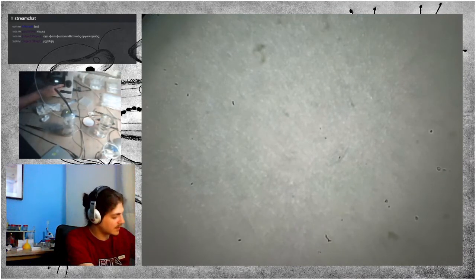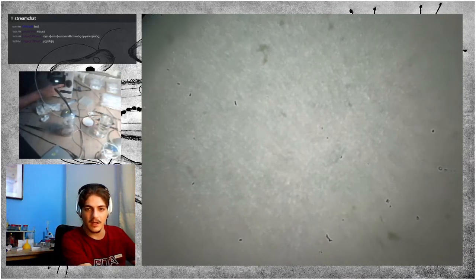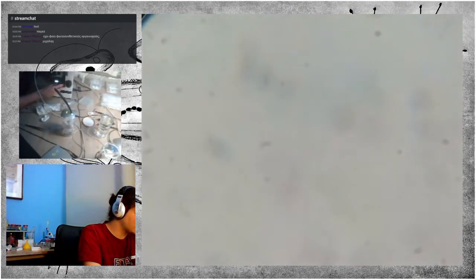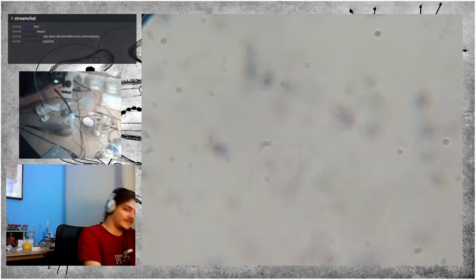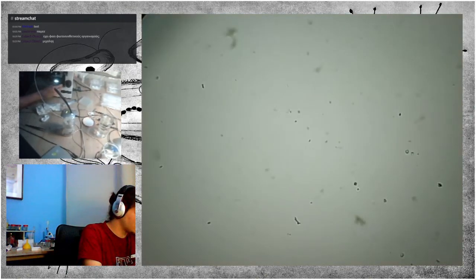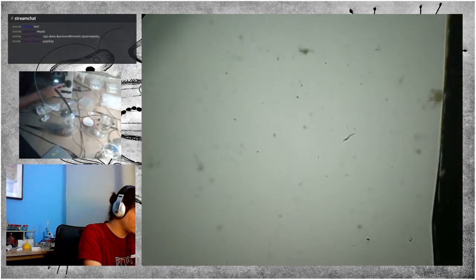For some reason it is quite dirty. Let me see. Oh, okay. Now it's good.